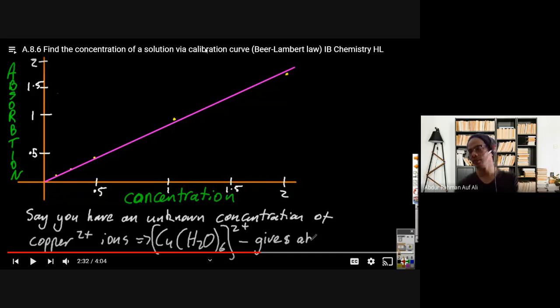So kalau kita just ambil a standard solution with high purity, they prepare a different concentrated samples, 5 samples, and then kita check dia punya absorption calibration curve. Kalau calibration curve dia straight line macam ini, maksudnya that spectrophotometer instrumen itu berfungsi dengan baik, boleh guna lagi.